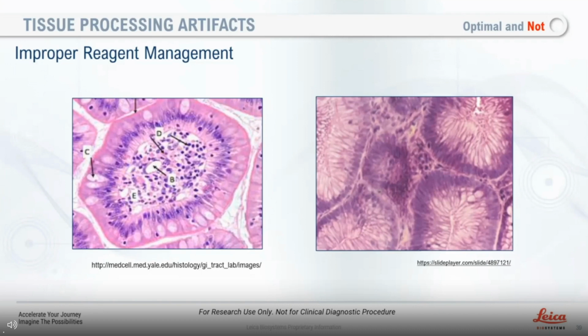Interesting. Thank you. You're welcome. Next question. Will overfixed specimens affect IHC staining? Yes. That is why we follow recommendations of a maximum time. If you're doing IHC, you're doing formalin fixation, usually you're going to do some type of antigen retrieval, and that's what remedies it, because those covalent bonds are so many when you have properly fixed tissue, where you want to be able to expose those sites that you're targeting for advanced staining.